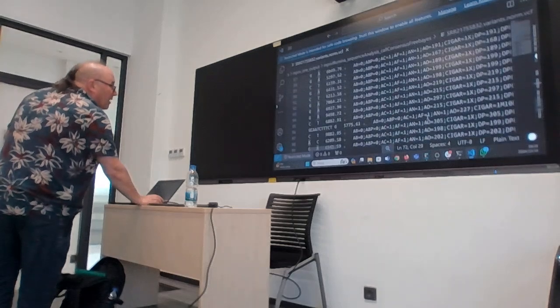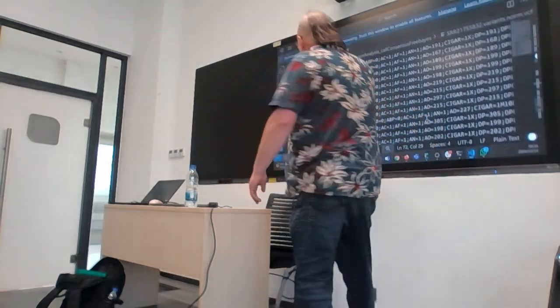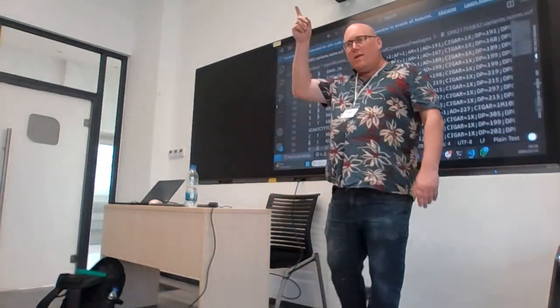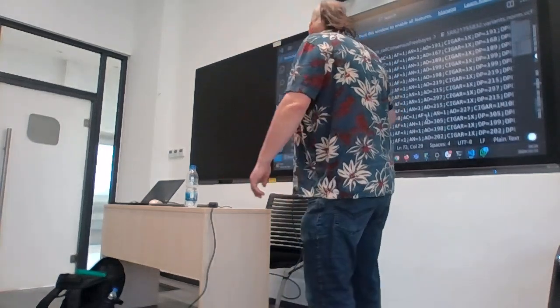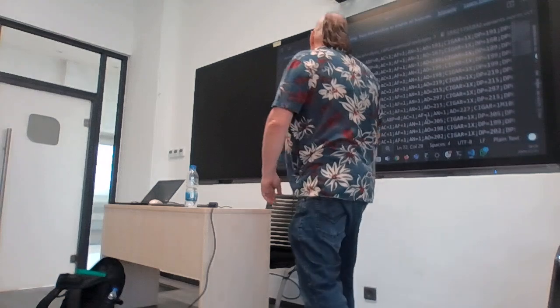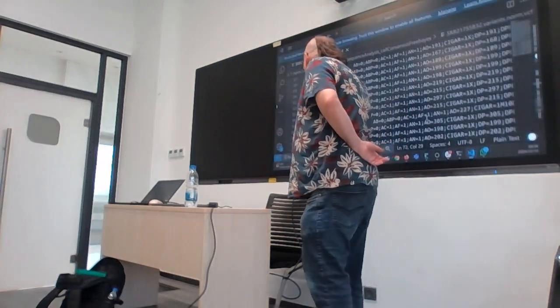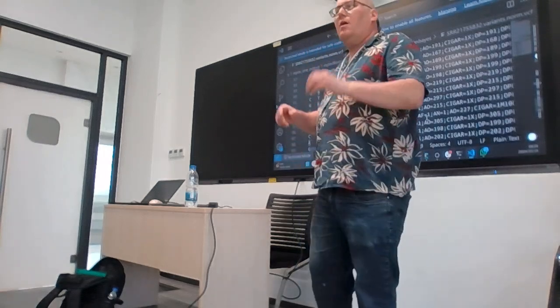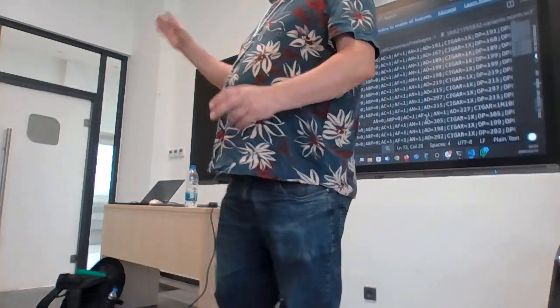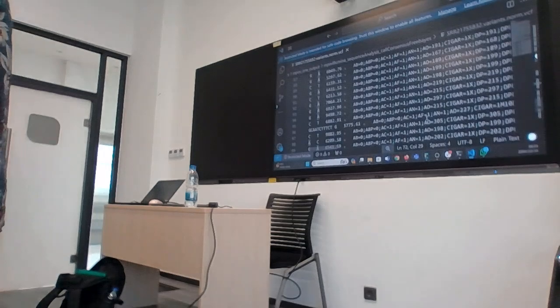Okay, then just one last other type of thing. These are single nucleotide variants. One nucleotide is changing from one nucleotide to the other. But this says GCA, ATC, TTC, CT became G. This is a deletion, okay? In the reference, there is more than in the variant, okay? But let's count this up, okay?